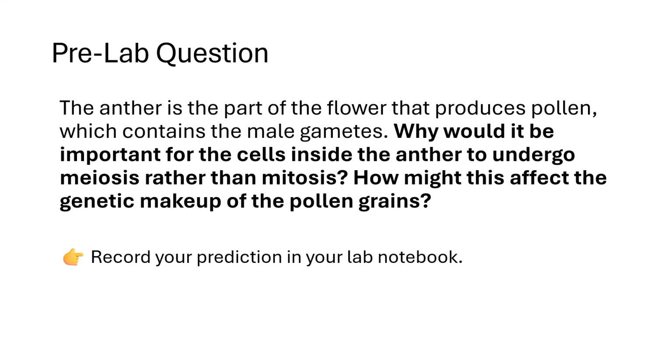Pause the video and record your prediction in your lab notebook. Then resume when you're ready to begin examining the slide.